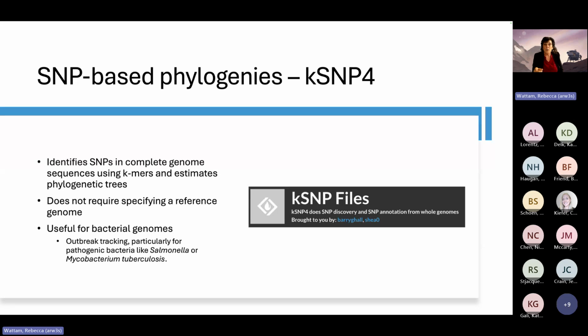So all of these things are looking at these specific changes. And this particular pipeline is really coming on strong, and people love it because instead of taking the read files and looking at all the SNPs across it and comparing it to a reference, which can have its own complications.